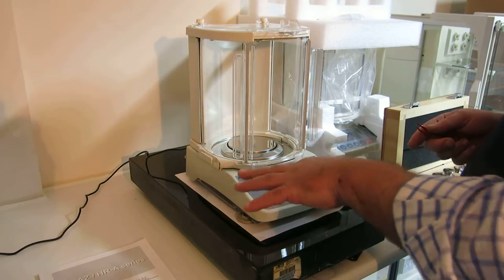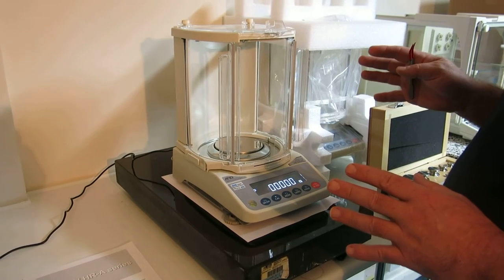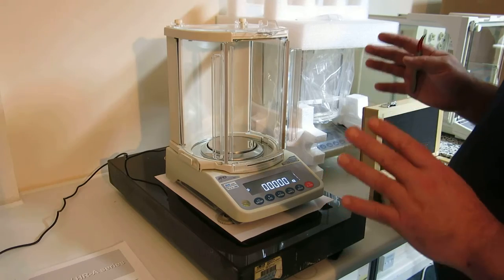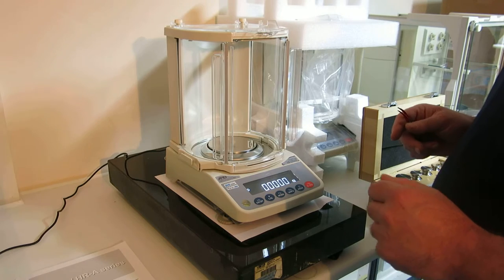So this is the A&D. It's got a super hybrid sensor. Very quick. It's got the beauty of the A4 footprint, and of course, the side draft shield comes off quickly for ease of cleaning as well.